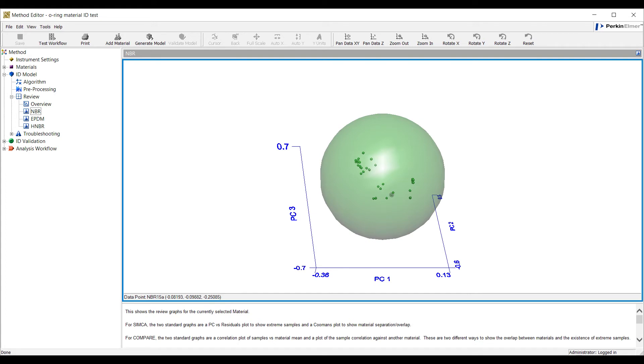Assure ID will employ the SIMCA algorithm, which is a principal components analysis. The principal components analysis allows the algorithm to characterize acceptable variation, which is defined by user-measured samples. By measuring a wide variety of samples, the user is able to train the algorithm on what constitutes acceptable variation in the sample composition.